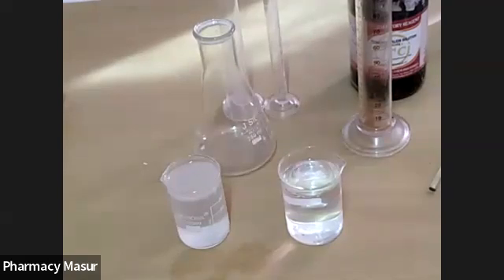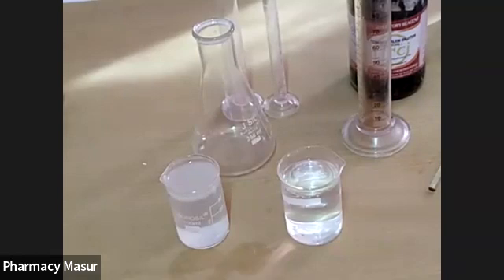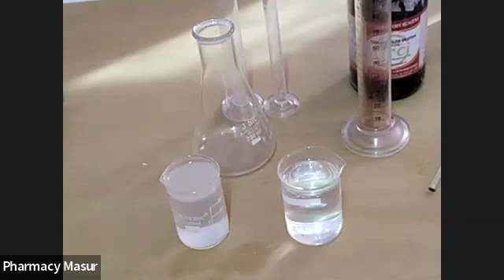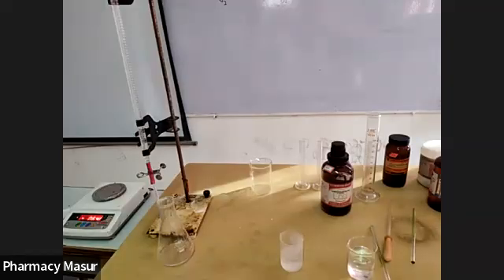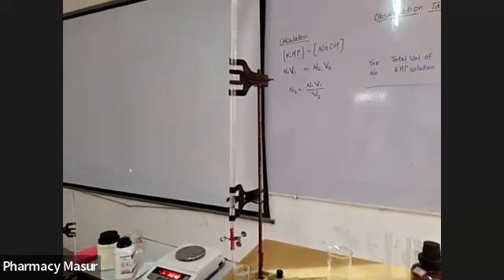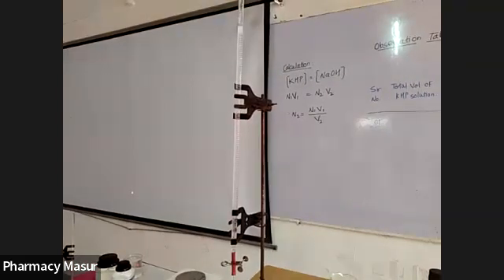We have to add the NaOH solution into the burette and the KHP solution into the conical flask, which acts as the titrate. The 0.1 normal NaOH is added into the burette, and the lower meniscus of the NaOH should be matched with the 0 level.